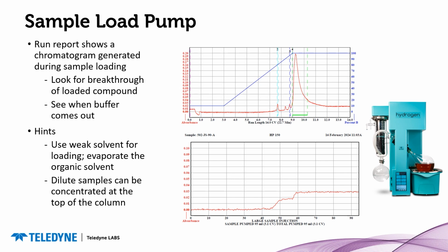Note that I'm using column volumes since any changes in the loading or wash will be visible in a minimum of 1 column volume. A column volume is analogous to the void volume and is commonly used for flash chromatography. Another use is to remove buffers from samples purified by, say, ion exchange, and then you can remove the buffers and then elute the peptide.